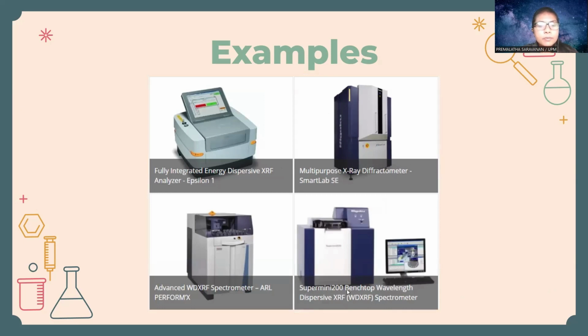And finally, Super Mini 200 benchtop WDXRF spectrometer. So as you see, Super Mini 200 benchtop WDXRF spectrometer is most widely used in industries nowadays.